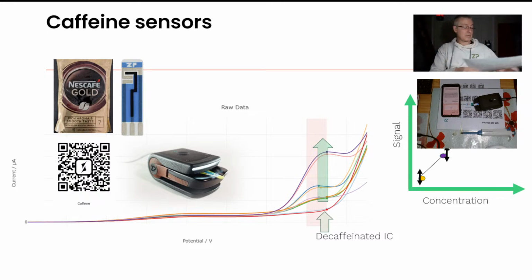So what does that mean? That means that realistically people in industry who want to measure caffeine for some particular reason can actually now use this instrument to measure caffeine. And we did that very quickly.